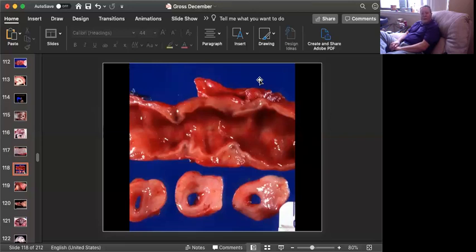And this is a tubular organ. Looks very congested. Maybe there's some necrosis and hemorrhage going on as well. It's very congested. And if you look at the wall, the lumen is sort of jaggedy, and the wall is extremely thick. And then when we look at this cross section, you can see that the intestinal wall should be very thin, and it is extremely thickened from the mucosa down to the muscular layers.